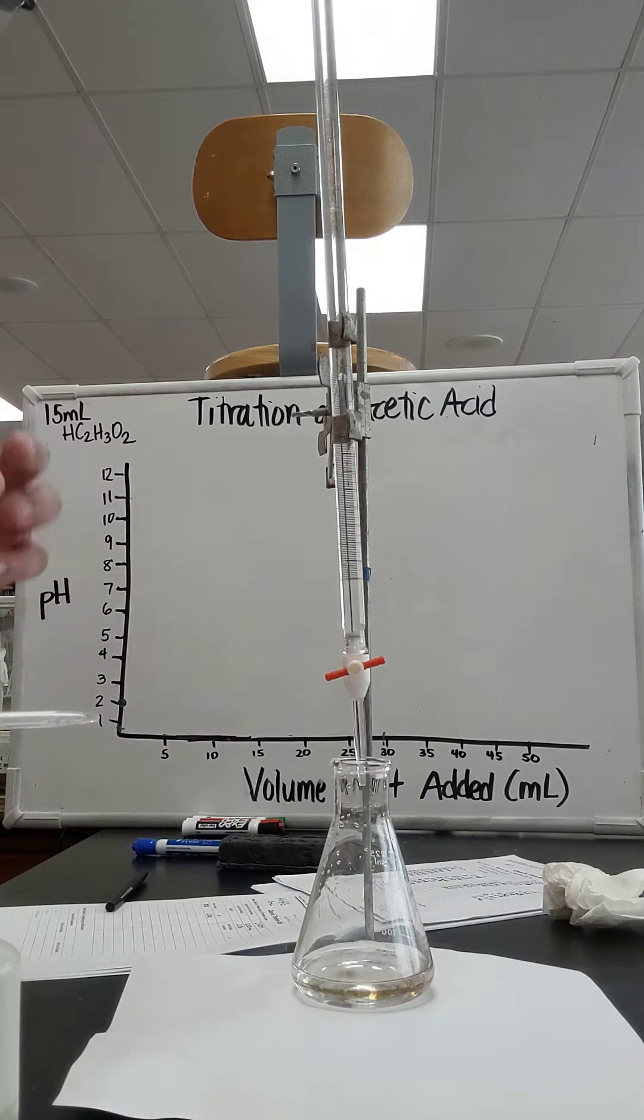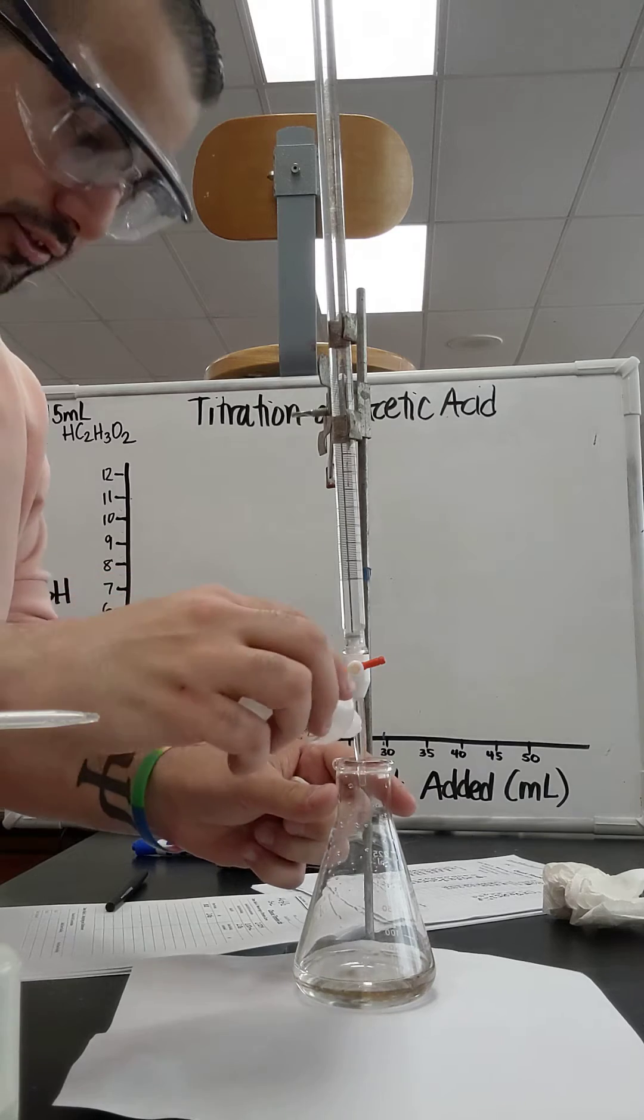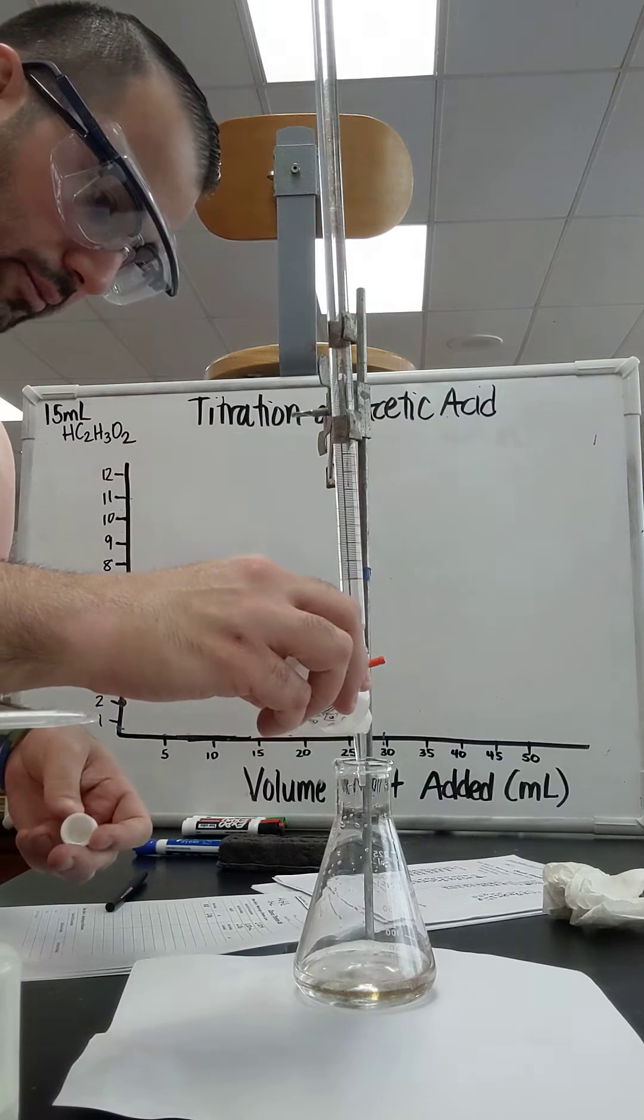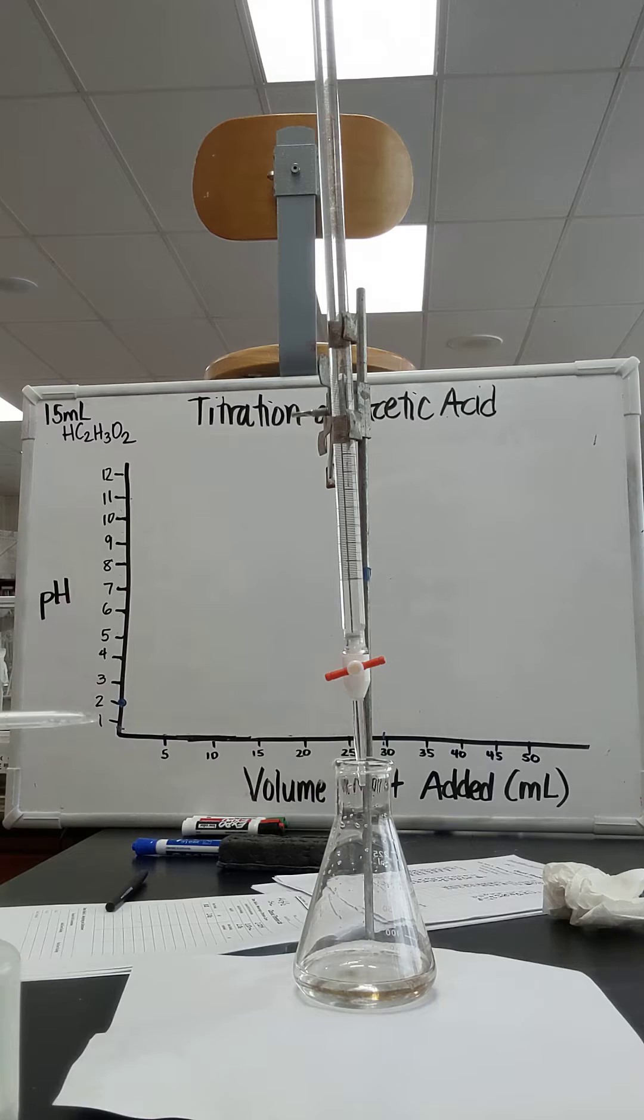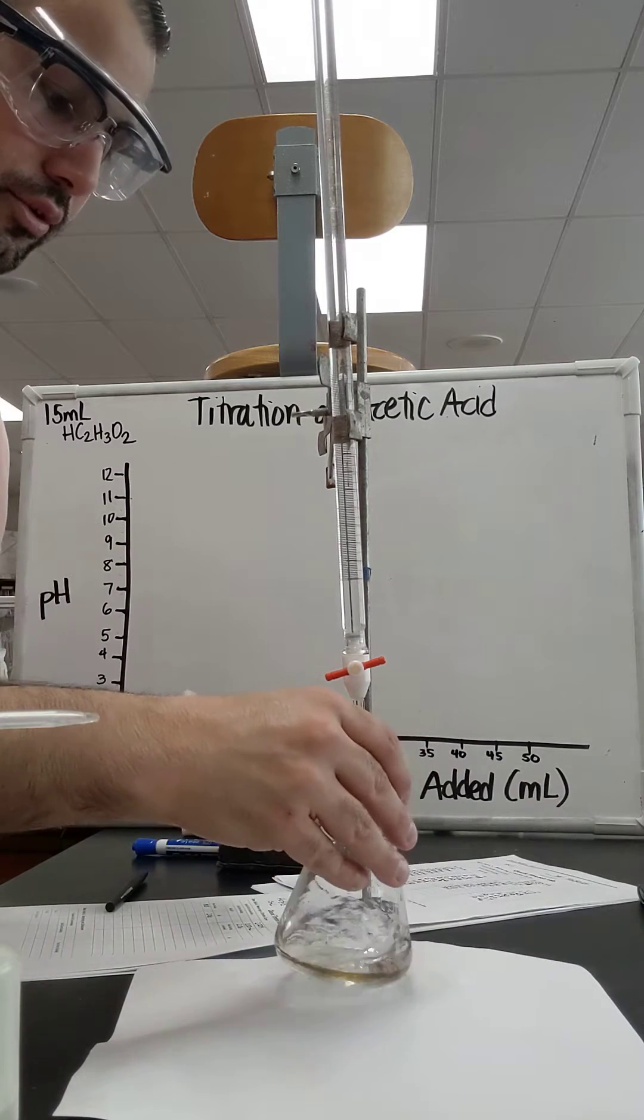Alright, now before we do the titration, we've got to add some phenolphthalein acid-base indicator. I did a couple of drops and I'm going to swirl that in there.